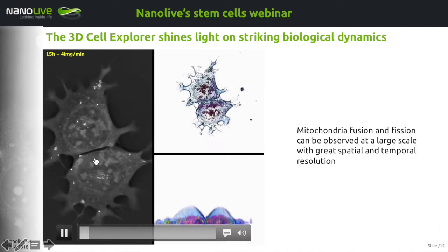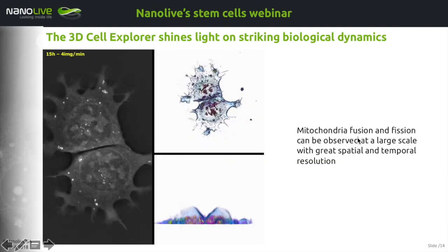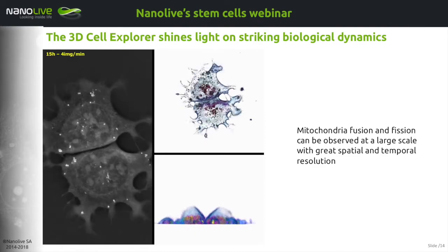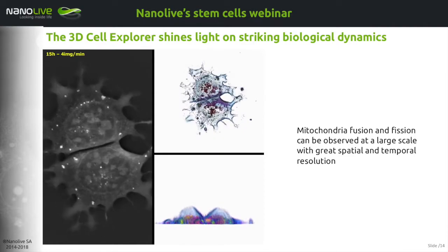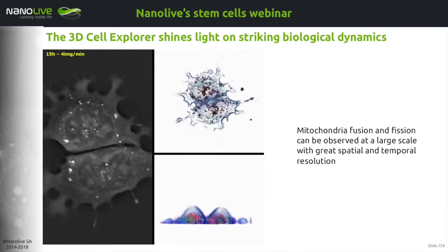We will go into more detail of fission and fusion events right now. What you can see here is a zoom in on some details of mouse embryonic stem cells, especially on mitochondrial tubules within protrusions from those stem cells. You can observe, following the blue arrow, an event of mitochondrial fusion between two mitochondrial tubules, while in yellow you can follow two events of mitochondrial fission. We have here a resolution of approximately 180 nm in X and Y — 180 nm of lateral resolution. It is clear that the usage of the 3D Cell Explorer will certainly open new doors to the analysis of the dynamic processes ruling the regulation of mitochondria, and new discoveries will certainly be made.